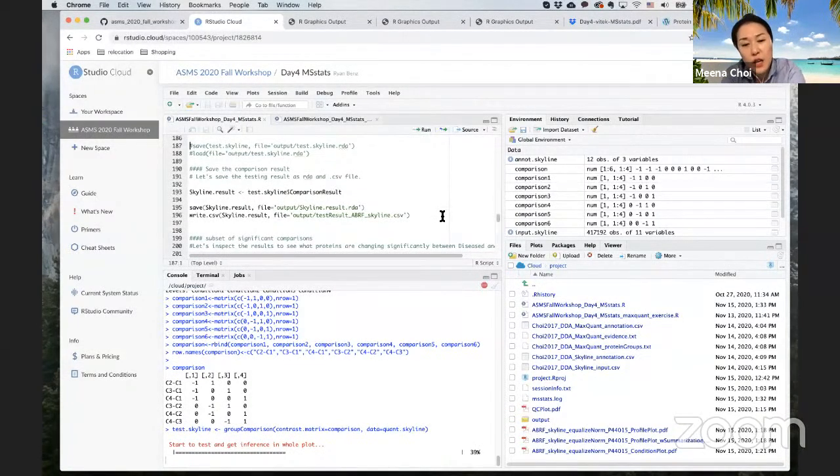For timing, DDA cases take just a few minutes. If you already have a defined script, it will take about 5 minutes for one DDA case. DIA cases really depend on the number of proteins and especially the number of MS runs. Around 20, 30 MS runs and around 5,000 proteins, on my laptop, just a regular Mac Pro, it will take like 10 to 15 minutes. But if you have a much bigger data set, it actually takes a really long while. We are actually trying to refactor the code and solve the memory issues. Any questions?